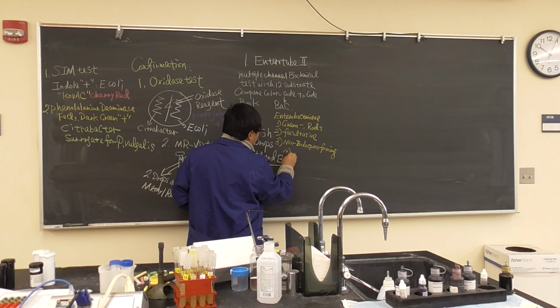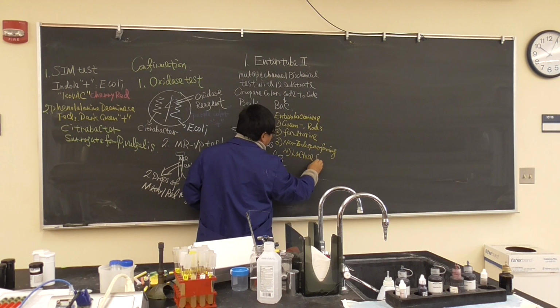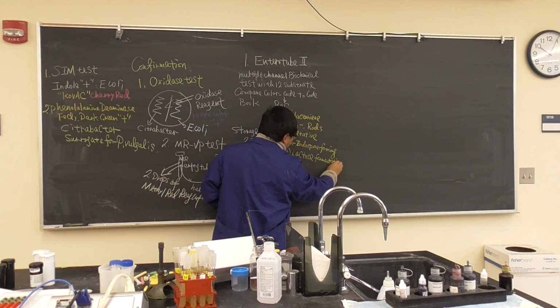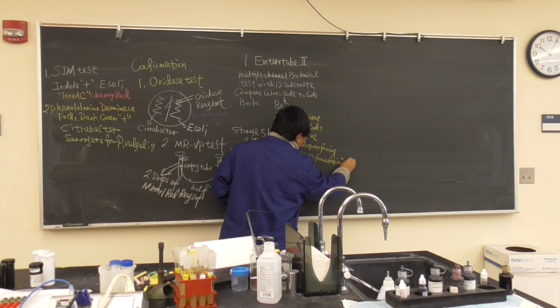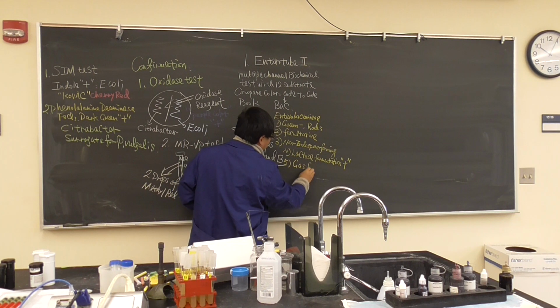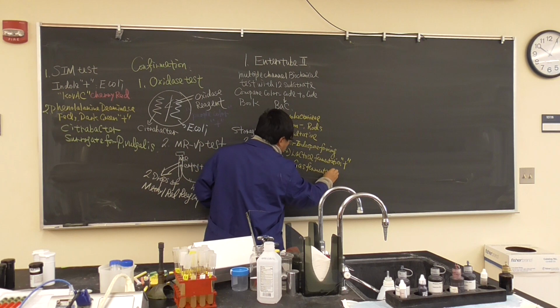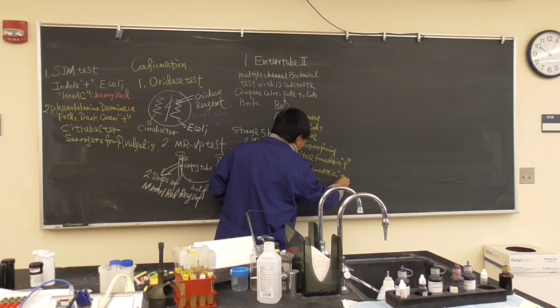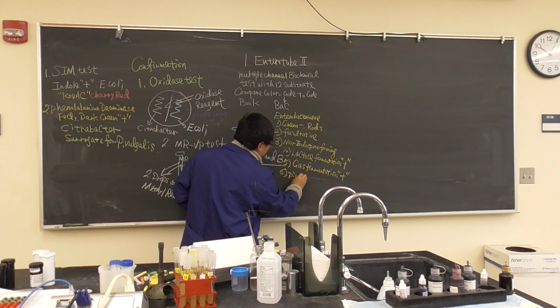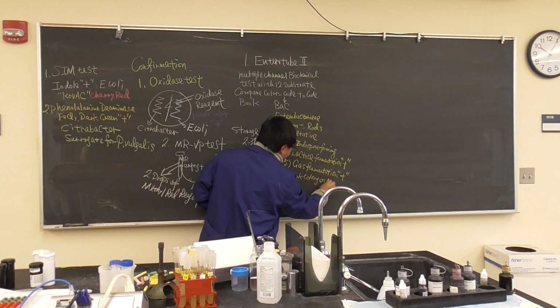And very important, lactose fermentation positive, and gas fermentation positive. In other words, pink colonies from MacConkey agar.